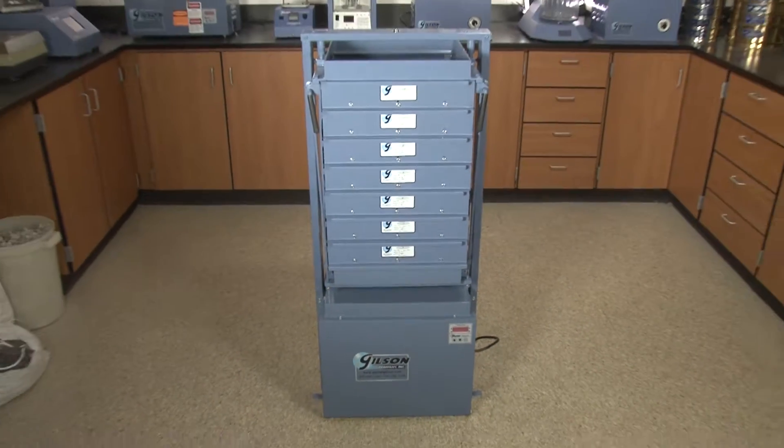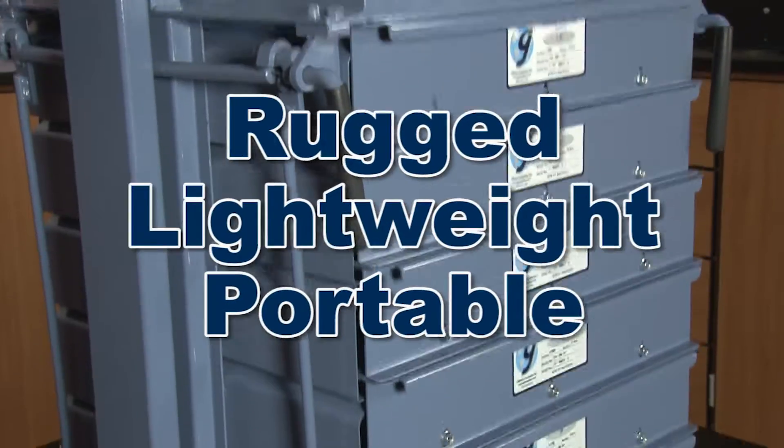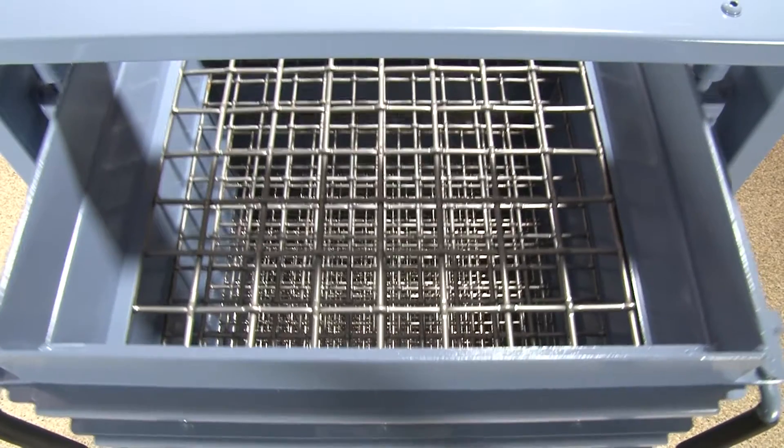The Gilson PS3 and PS4 Porta screens are designed for high performance and rugged durability, yet light enough to be portable, whether in the lab or in the field.